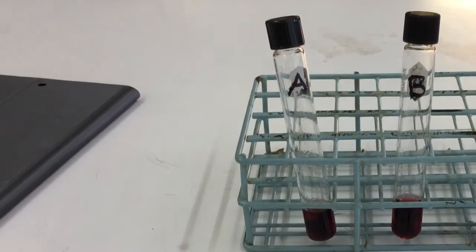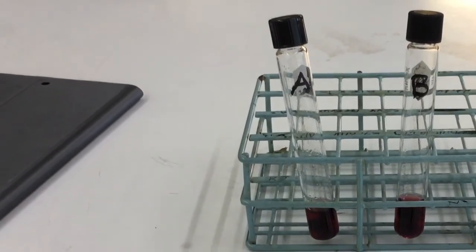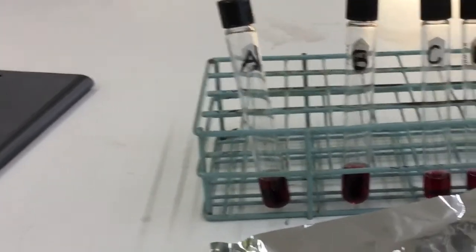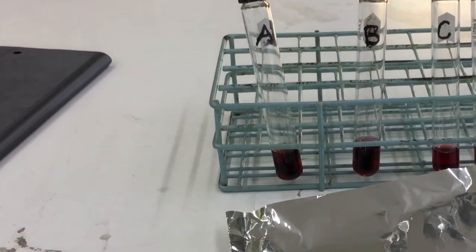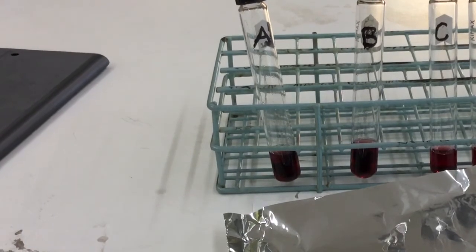Test tubes A and D will be completely covered in tinfoil, using tinfoil like that there, and so that A and D will be in the dark.